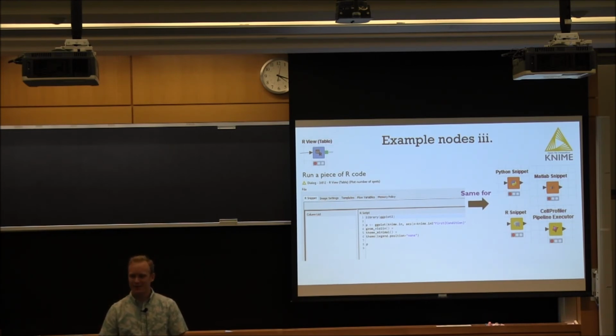Yeah, practical point, if someone wanted to move into KNIME, what's your workflow? Do you exclusively work in KNIME to sort of start with one image and settle on your parameters, or do you play around in Fiji, get to know what processing might work, and then put it into KNIME, or is it really user-friendly where you get a lot of visual feedback on how things work?